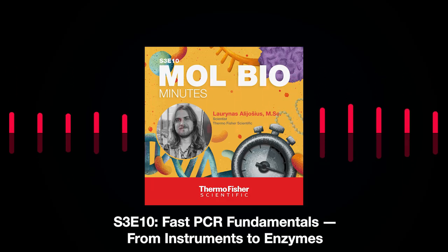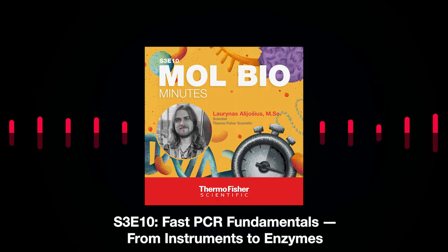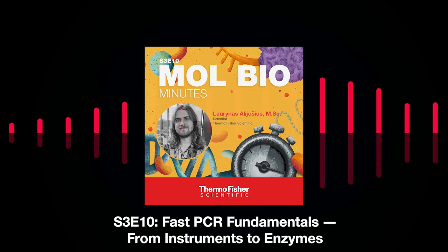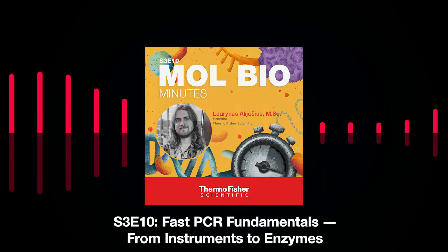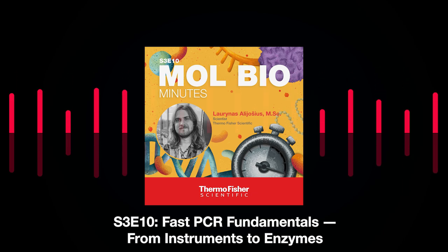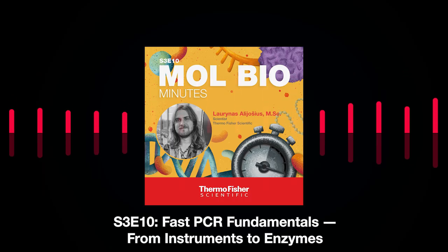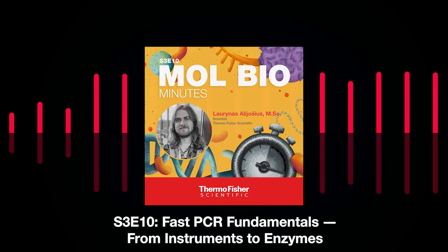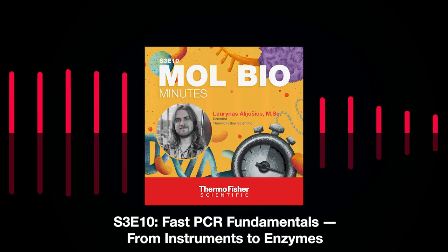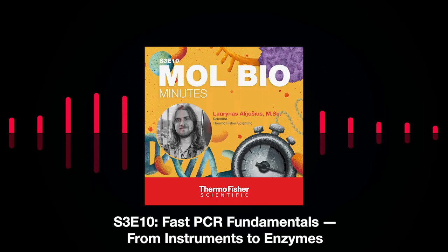So when you set up your number of PCR cycles and when you choose if you want to do the two-step or three-step version of the PCR protocol, you can start shaving the duration of every PCR step. If you usually do the initial denaturation step for 3 or 4, maybe even more minutes, you can maybe try to shorten it down to 1 minute or to half a minute.